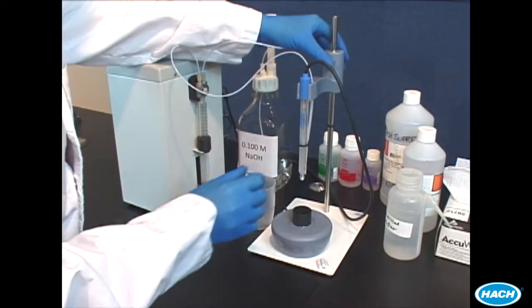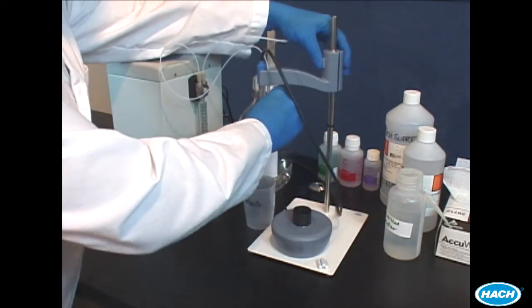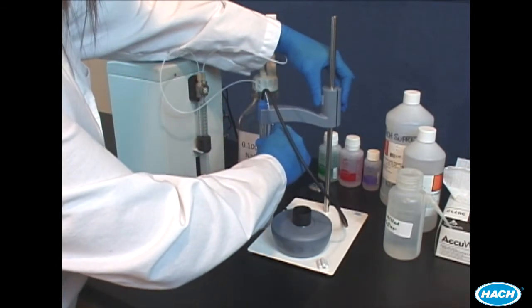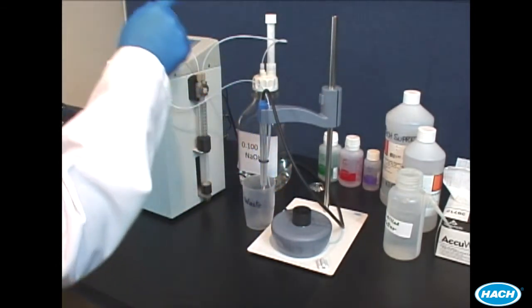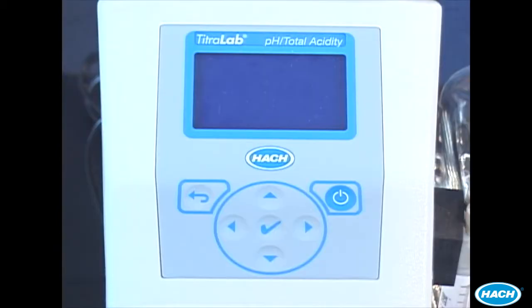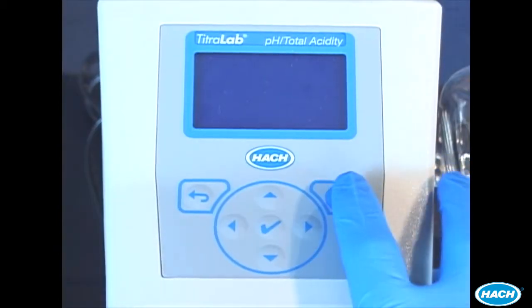First we will prime the burette. This should be done at the beginning of each day. Check that the bottle of sodium hydroxide is not empty and make sure a waste beaker is under the electrode. Now turn on the instrument.